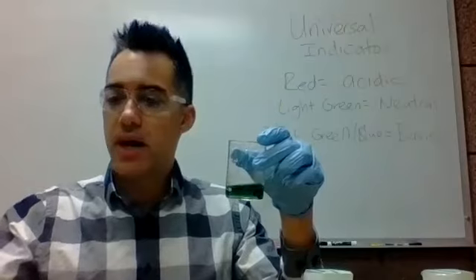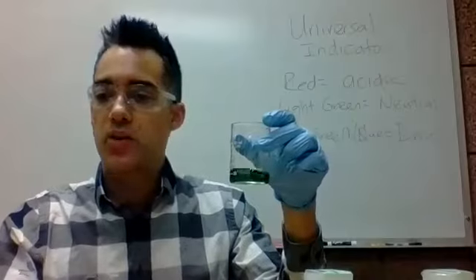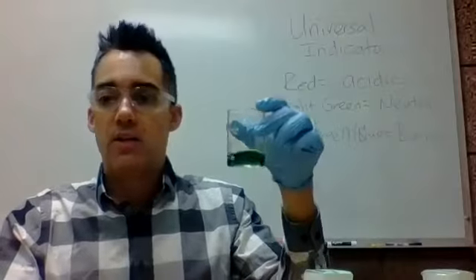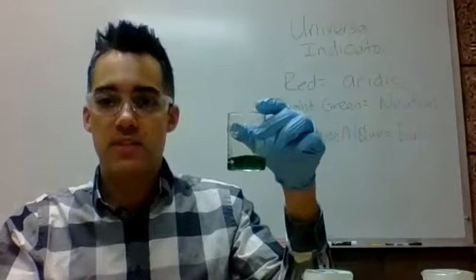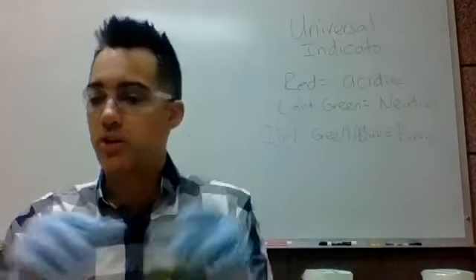What do we have here? Potassium iodide contains a metal cation, which has no acid-base properties. And we also have the iodide ion, which is the conjugate base of the strong acid HI. I-, because it's the conjugate base of a strong acid, is completely ineffective as a base. And so what we have in this solution are 2 spectators in water, and so this solution should be neutral.